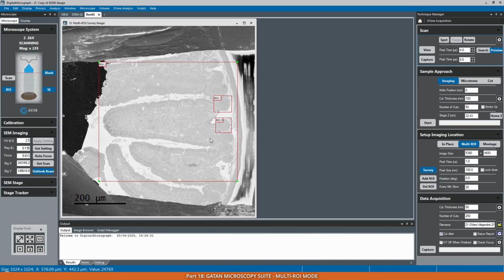Now, the typical problem with this, you see, if I want to modify these boxes, I can't do it because my ROI box is over them. Usually, what you do in this case, you can put it to back, send it to back. Now I'll have access to these two. And for example, I can change the settings for this.